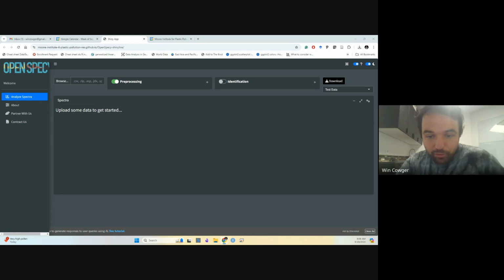You can also follow along if you want. Today we're going to be focusing strictly on hyperspectral image analysis. If you want to follow along using the R app, go ahead and do that. Also, if you want to go to www.openspecy.org, go ahead and do that too. It's basically going to be the same exact thing. That's the goal anyways. But if any questions or issues come up with using any of those different services, let me know. All of them should work the same way.